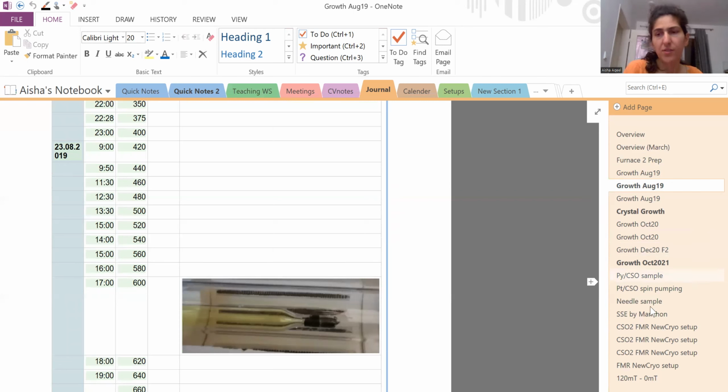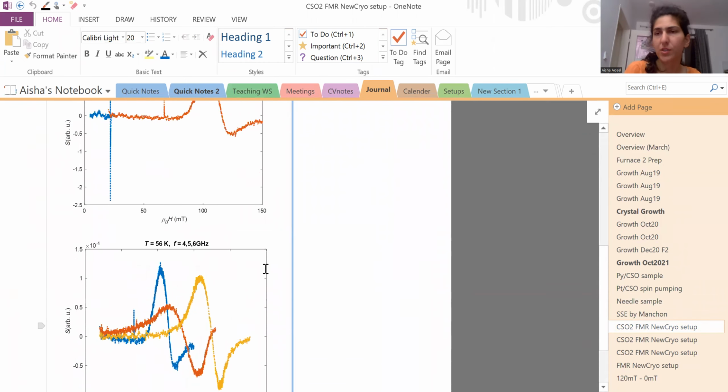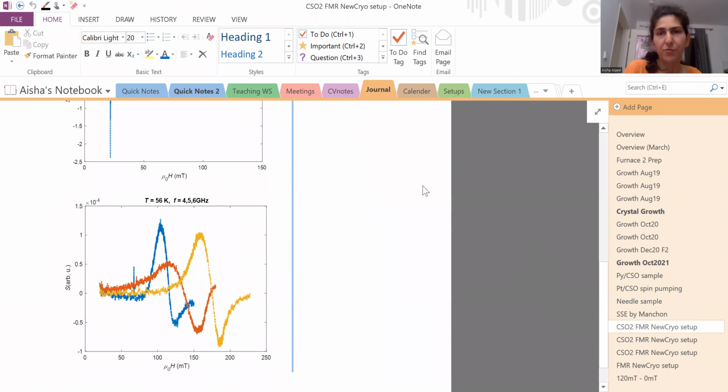And this is just some examples. So how you can just create different things, you can put results, and it's very quick to go. Then after this one, it's about detailed information, where you can write everything you have done.